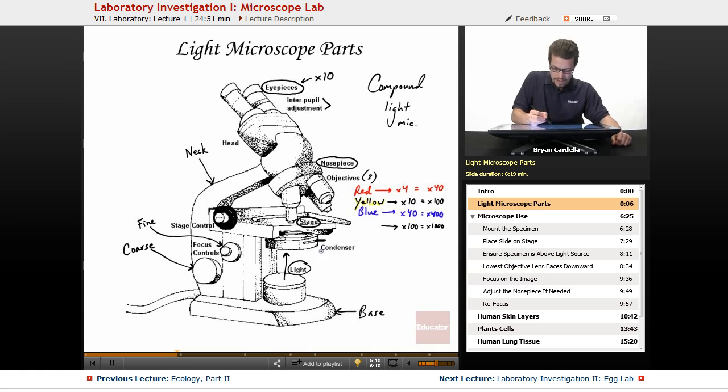The condenser, I haven't really mentioned what that actually does. You can adjust how much light is actually going through the condenser and into the stage region. So those are the major parts of the light microscope.